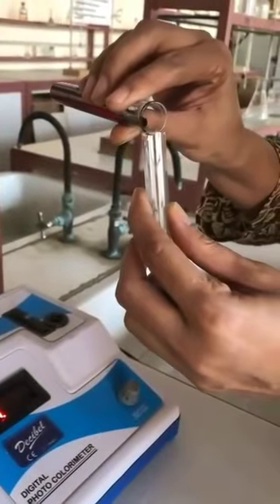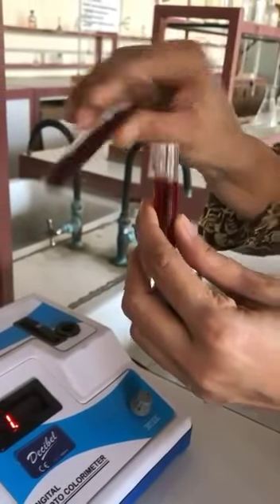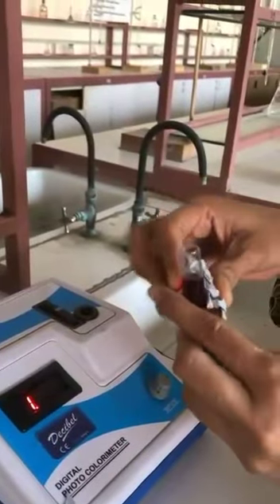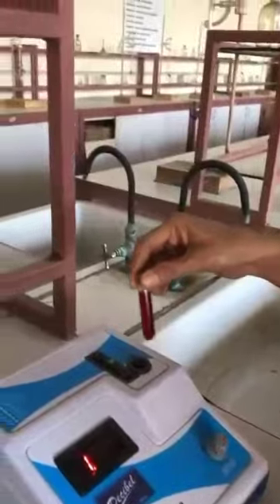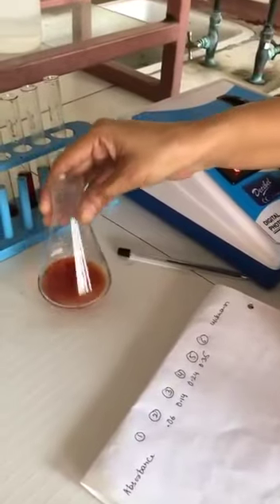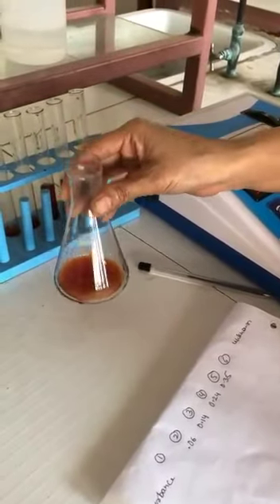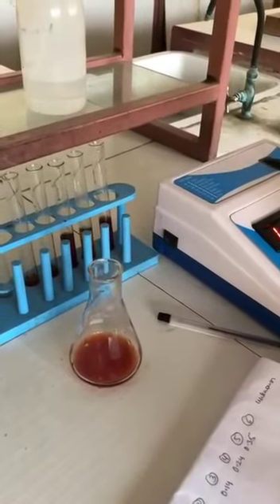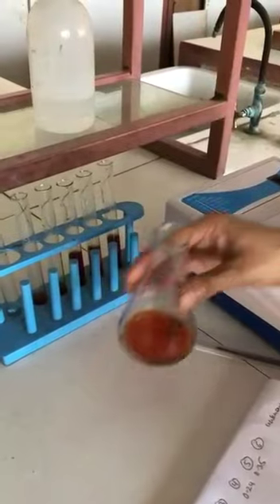Now, take the fifth test tube. Fill the cuvette 3/4. Dry with filter paper and insert. So, in this conical flask, we don't know what the concentration is, and our main objective is to find out the unknown concentration of iron.